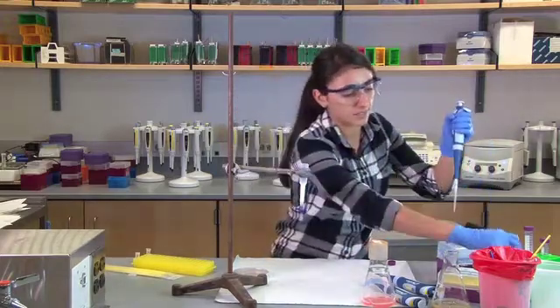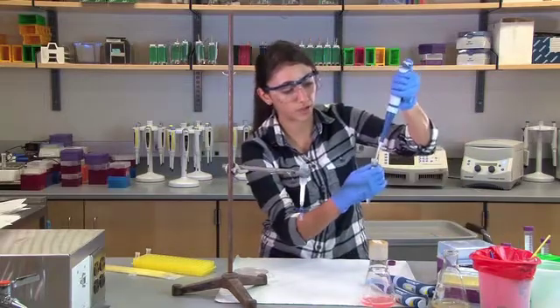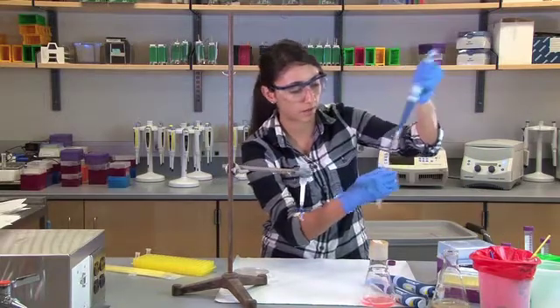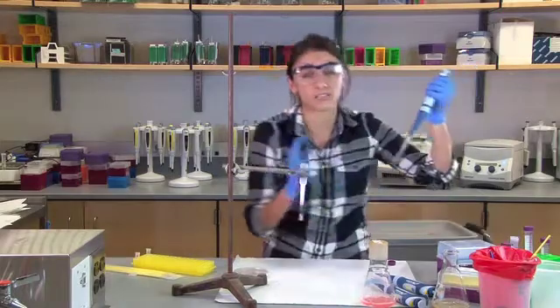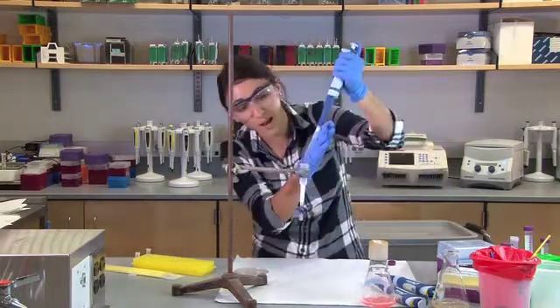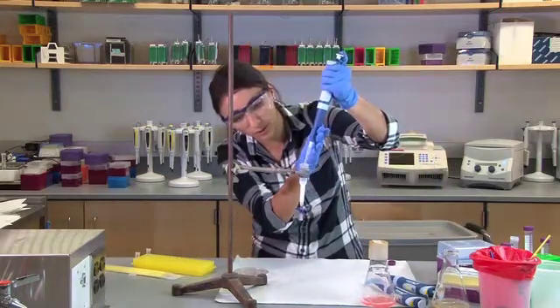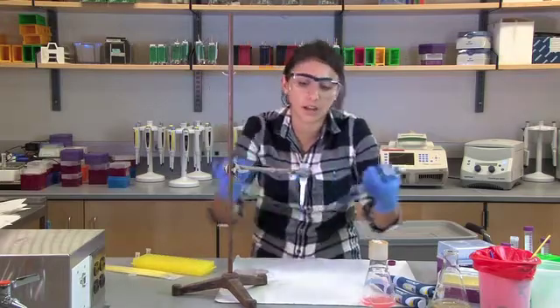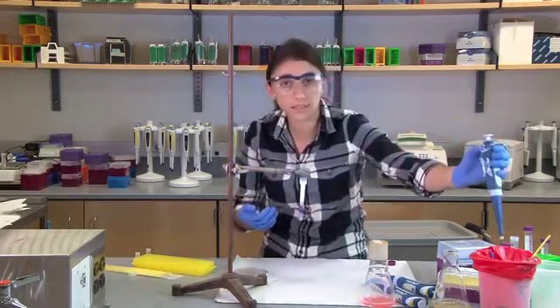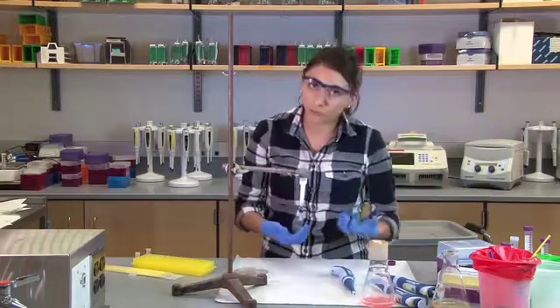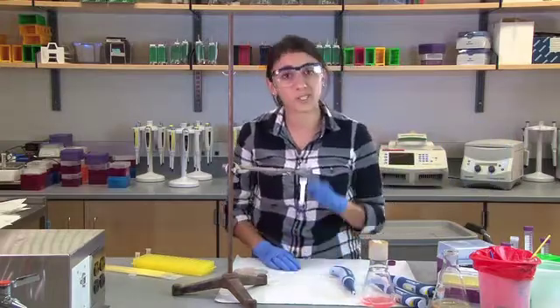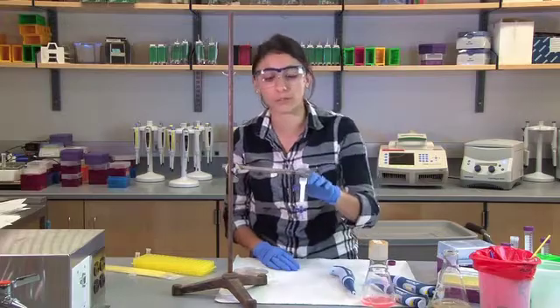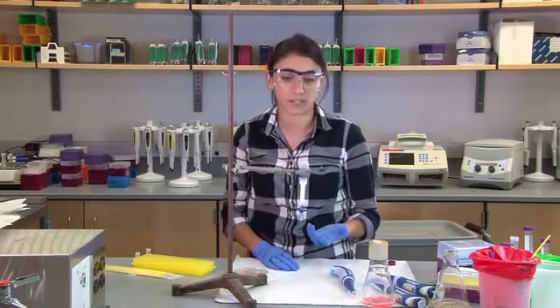Like I mentioned, some students, they're pipetting gurus and they want to pipette as fast as they can. This is a very slow lab. They need to have patience. But what you may see is if you go really fast, all those resin beads at the top layer puff up like a cloud. And now unfortunately, that group must wait even more time for those beads to settle before they could add their next buffer.